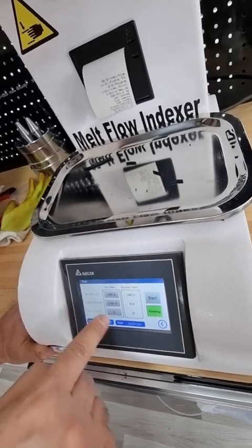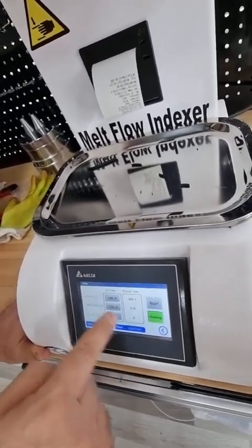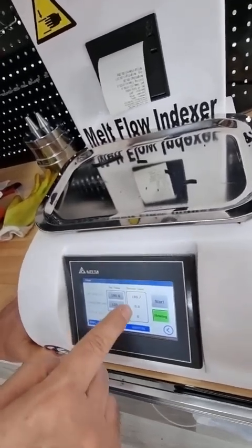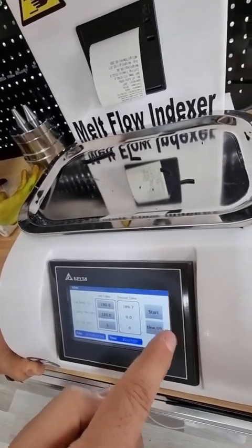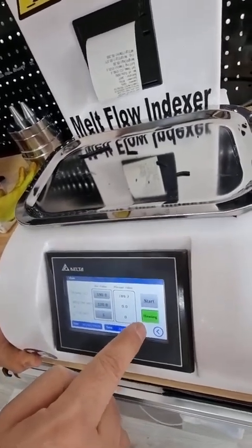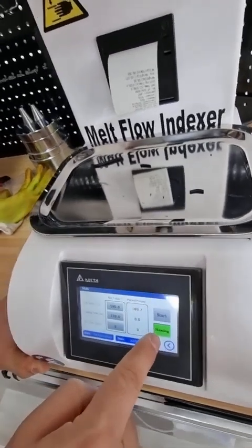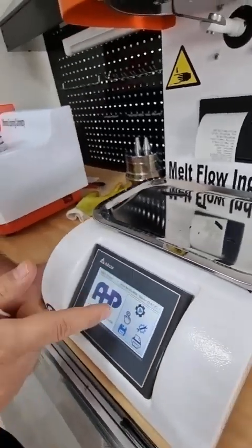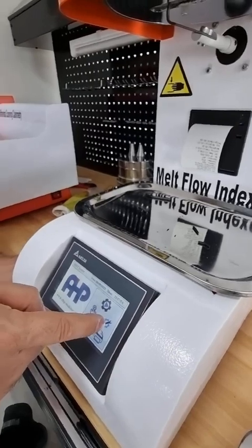Set the cutting interval here. A number of cuts of 5 is enough for measurement based on Type A according to the standard. After setting the temperature, click on 'Heat On.' When you click on heat on, it turns green, showing that heating has started.